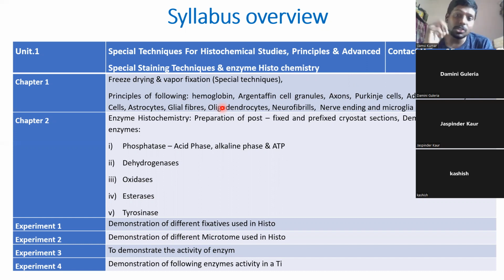Because usually fat will be directly dissolved in alcohols, we know, right? Fat will dissolve in alcohol. Since we are using dehydrating agents, all fats will be dissolved. So that's why we are bypassing all those issues with the help of this approach.